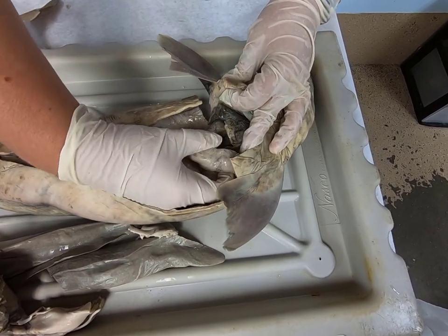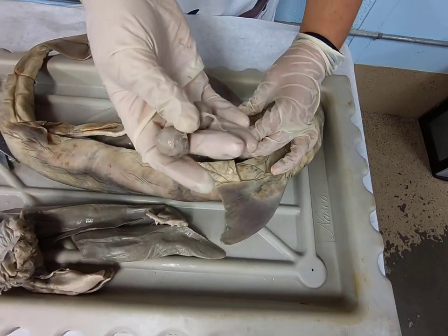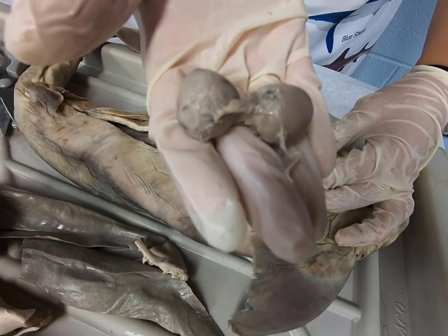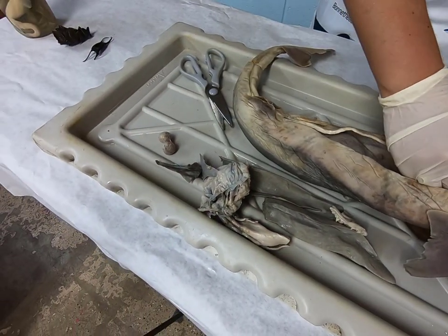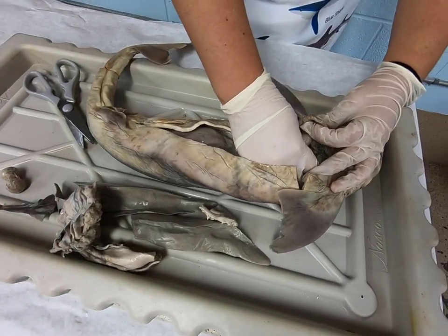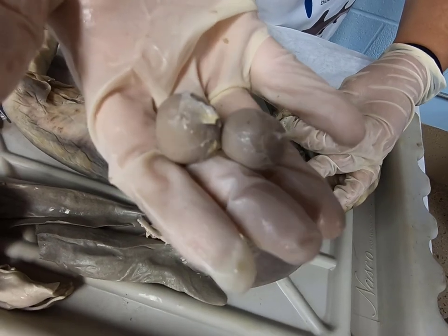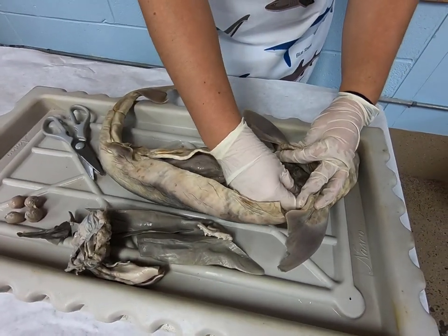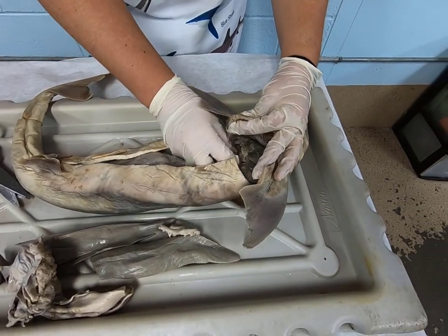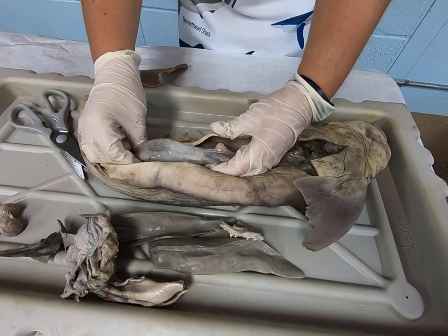So I'm gonna pull them out. It's a really thin layer, so you can just pull them out. And these are actually undeveloped eggs. So we have two right here. And we have, seems like, two right here. So two more. So far, we have the potential for four babies in the shark. Let's see if I can't find any more. And let's see what we have in here. So this is promising.